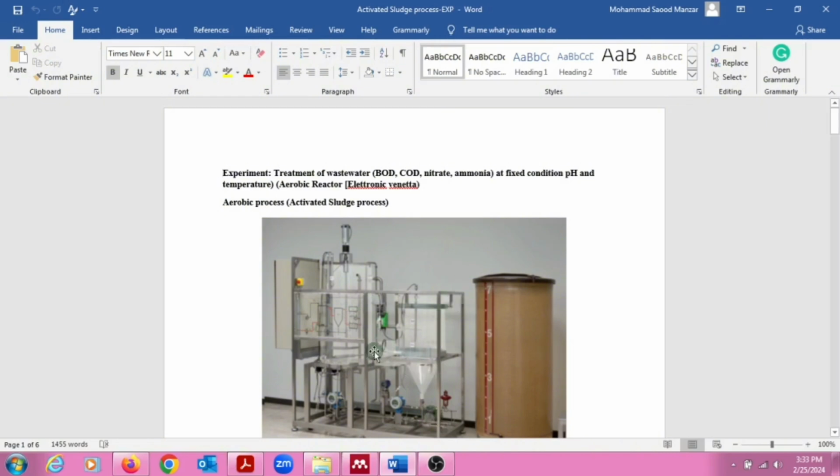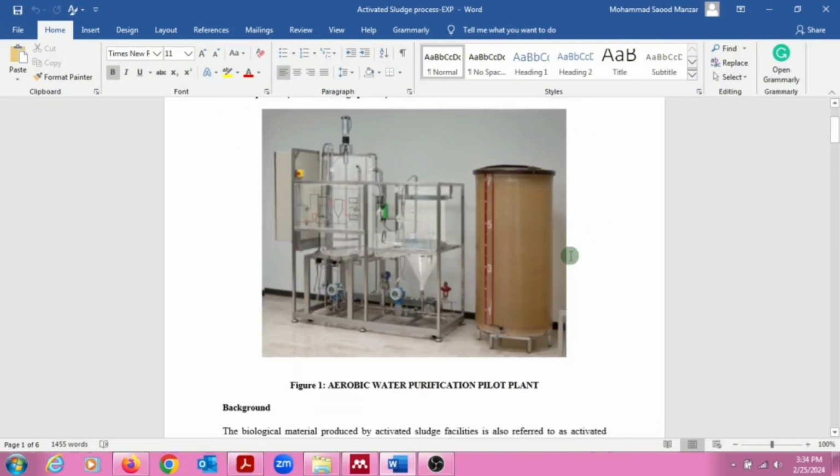At the back we have a disinfectant tank filled with sodium hypochlorite. Here we get the treated water, and the metering pumps pump a fixed dosage of the disinfectant into the treated water. So at the outlet we receive water with the least microorganisms compared to the raw water in the reactor tank and the water collected in the secondary clarifier.